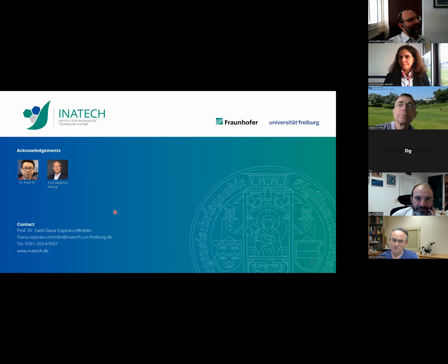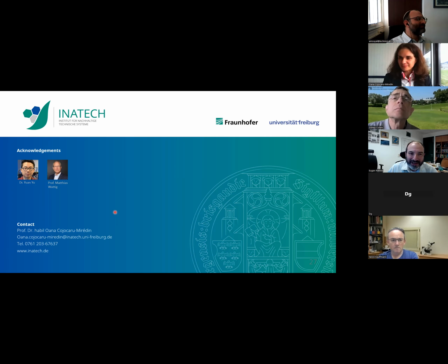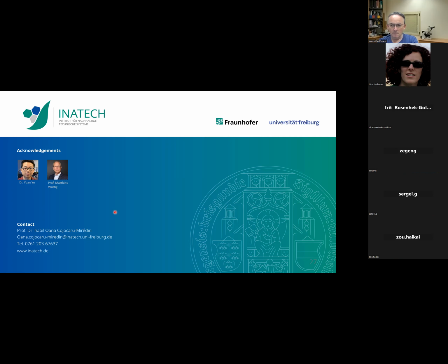Okay, thank you. Yes. Thank you for the interesting talk. Could you comment on the possibility to detect light atoms like hydrogen, deuterium, or tritium with the atom probe?